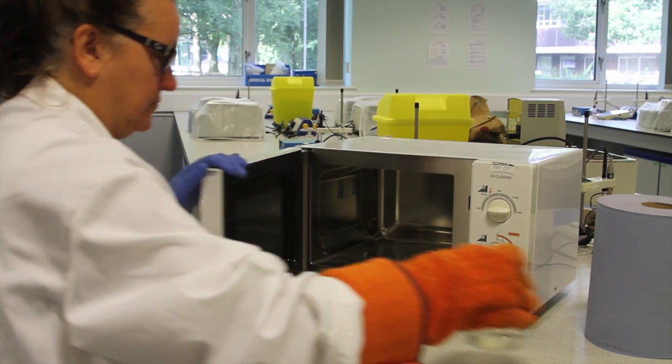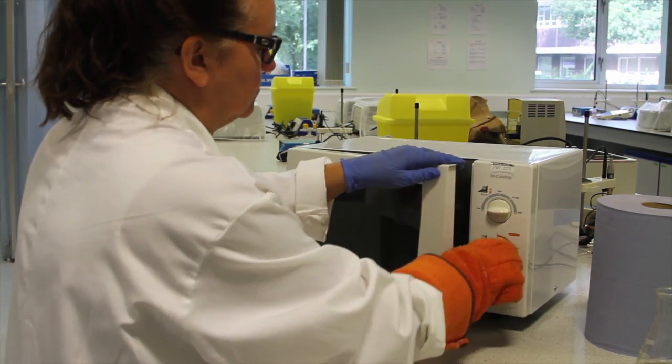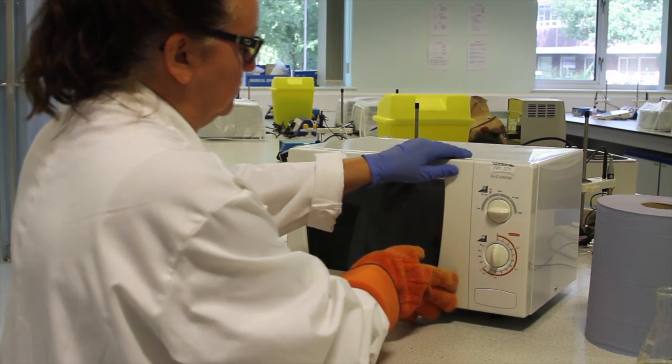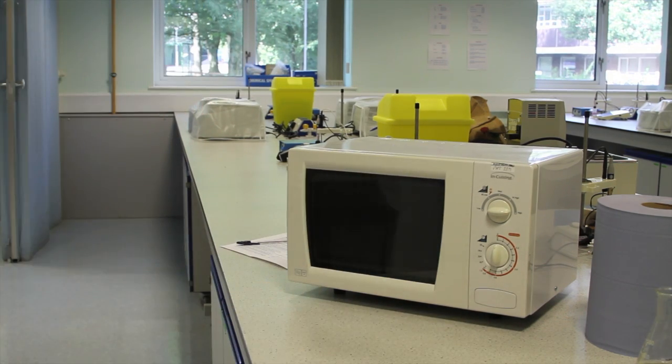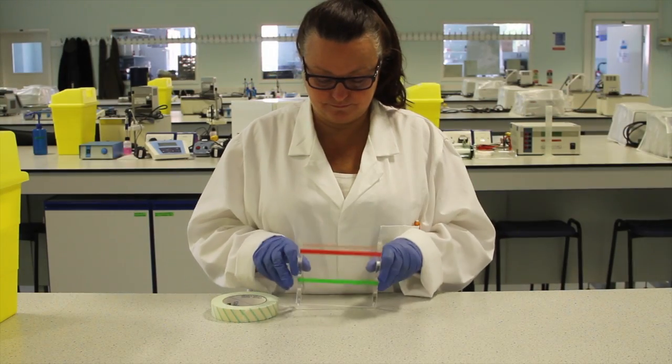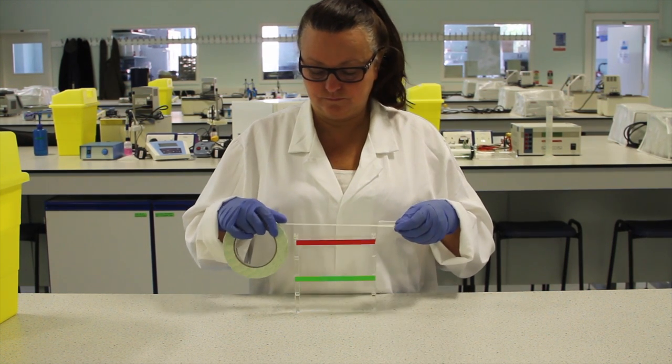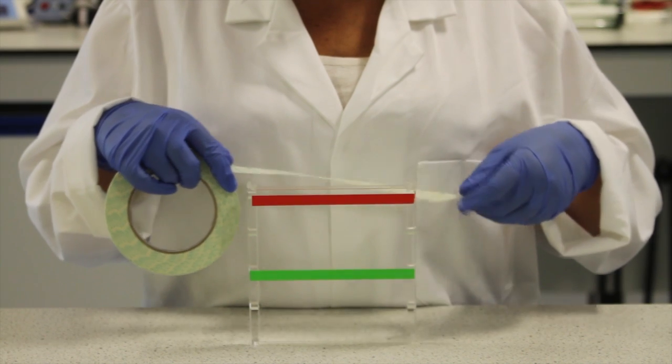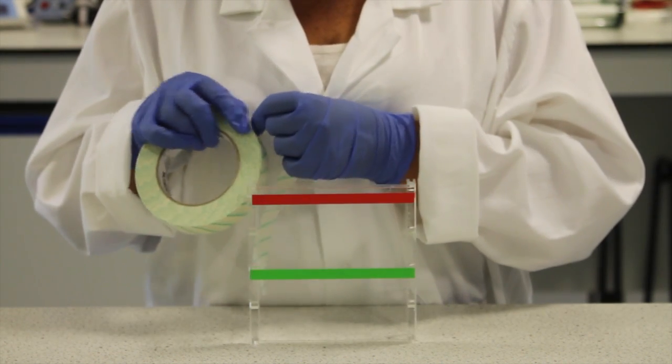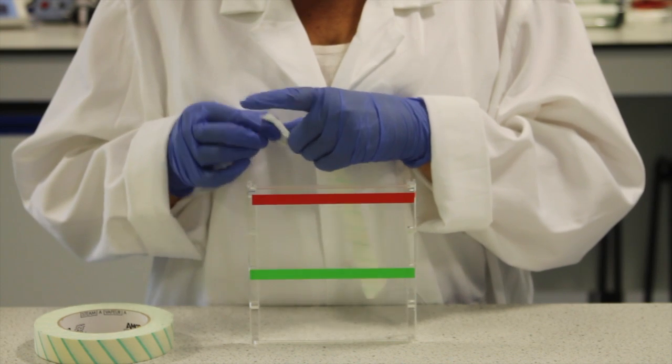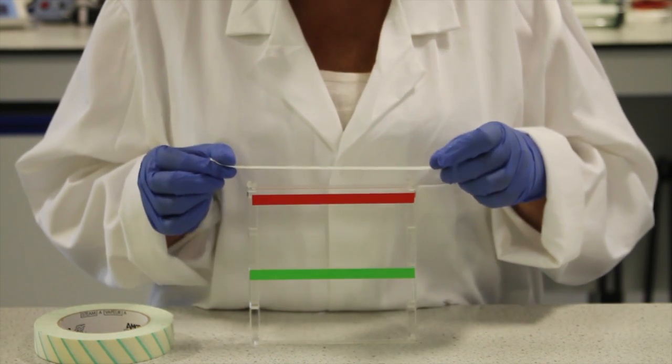Ensure you are wearing the heat proof glove before removing the hot flask. While the gel cools, prepare the gel casting stand. The casting stand needs to be sealed off at each end using tape so that the gel won't run out. To seal the casting stand, tear off a length of tape and attach it securely along the open edge of the stand.